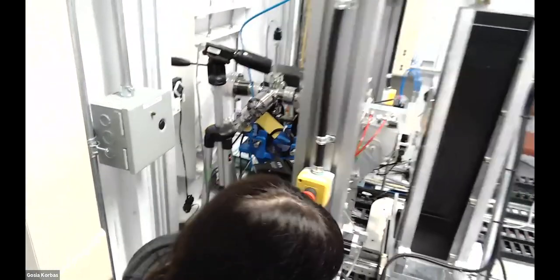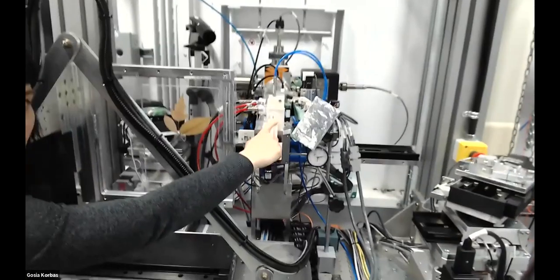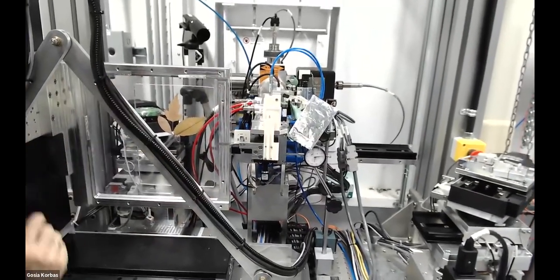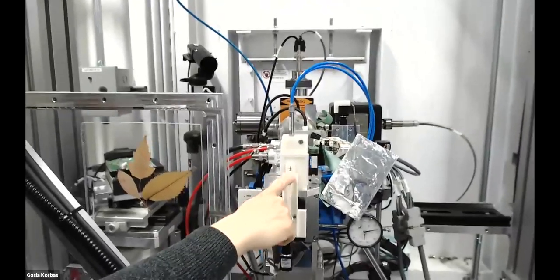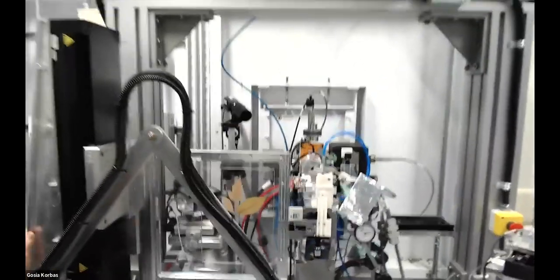And then at the very end of it, we have small apertures. So we make the beam that comes from the other hatch even smaller. And the experiment is done in the following way. Pointed again. Okay. So here we have this. These are the apertures here. And the experiment is done the following way.